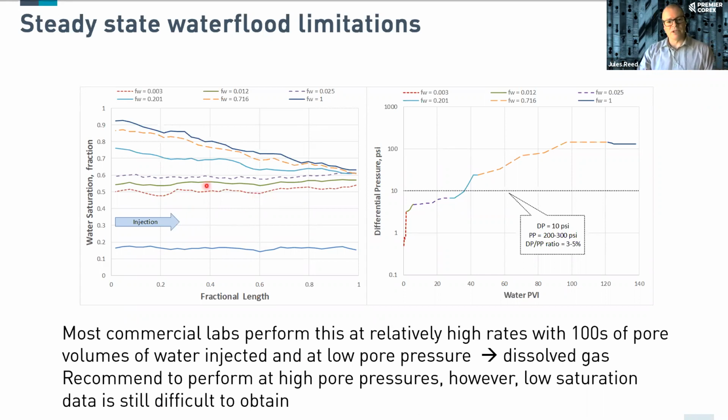of water injected. And so what we could observe here is some saturation data at 3 fractions, and then at this 4th fraction, there's a fairly even distribution, but at this 4th fraction, we begin to see it starts to incline. And this is because we're now moving into a dissolution process rather than just a relatively immiscible displacement.